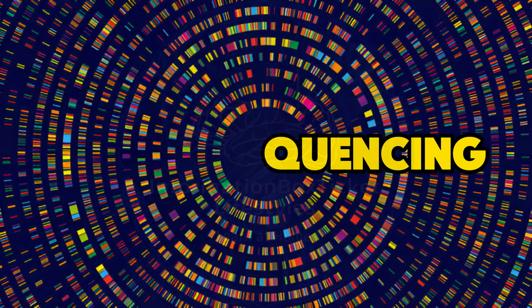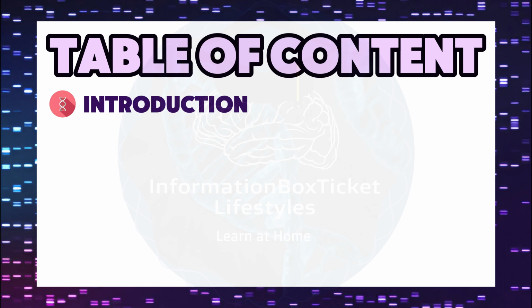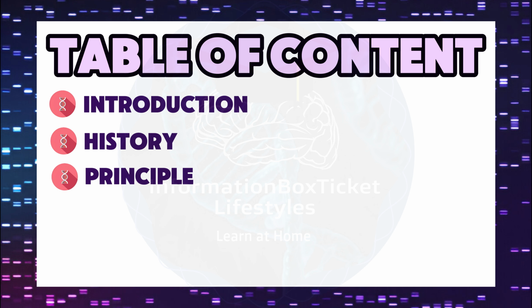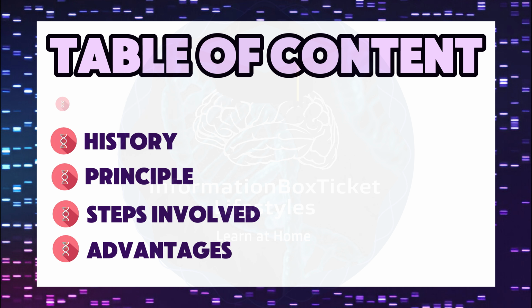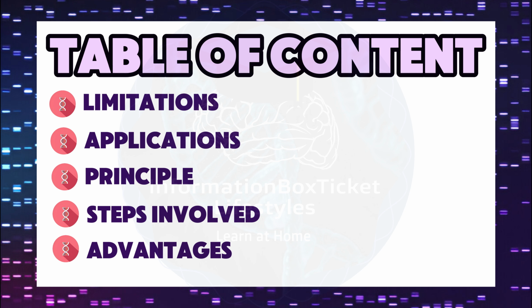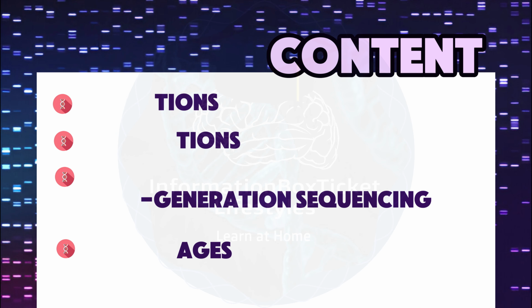Sanger sequencing. Table of contents. What is Sanger sequencing? The history of DNA sequencing. Principle of Sanger sequencing. Steps involved in Sanger sequencing. Advantages of Sanger sequencing. Limitations of Sanger sequencing. Applications of Sanger sequencing. Sanger sequencing versus next-generation sequencing.